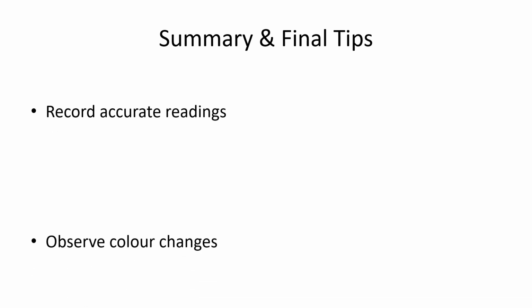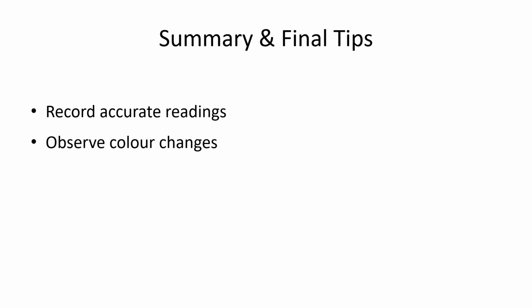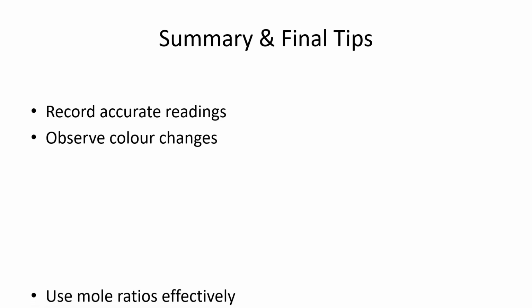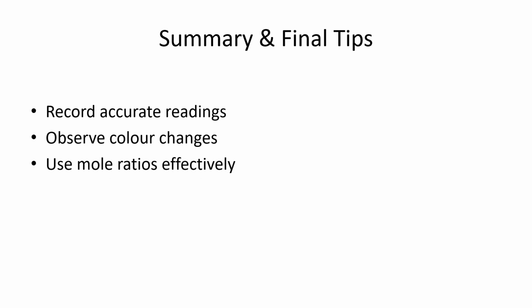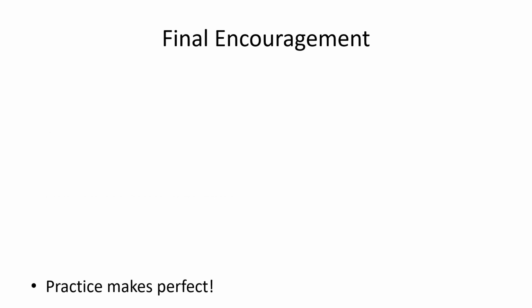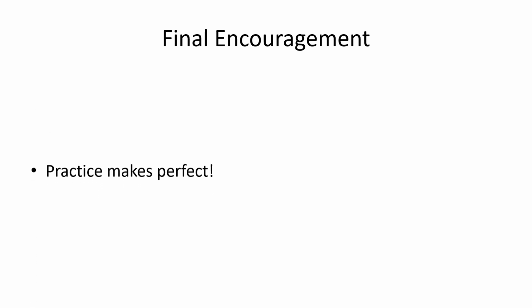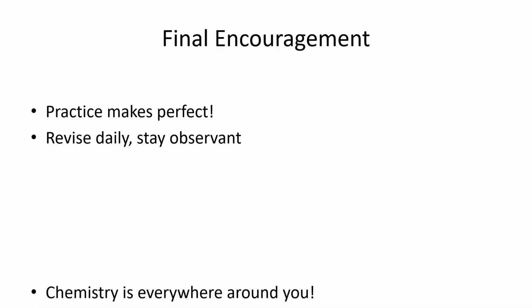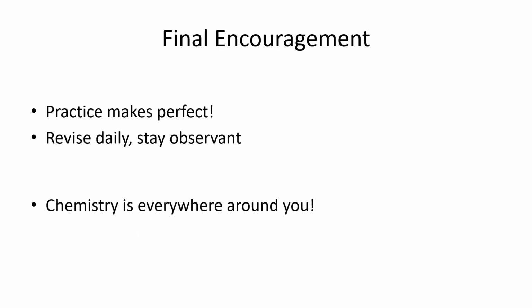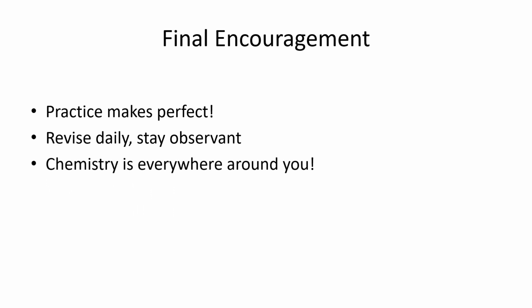Always approach practical chemistry with confidence. Remember to record accurate readings, observe color changes keenly, and apply mole ratios effectively in calculations. Practice makes perfect. Review past titrations, test your understanding with balanced equations, and know your indicators. For qualitative analysis, always interpret your observations carefully using standard tests. Stay sharp, revise daily, and success will follow. Keep experimenting, chemistry is everywhere around you.